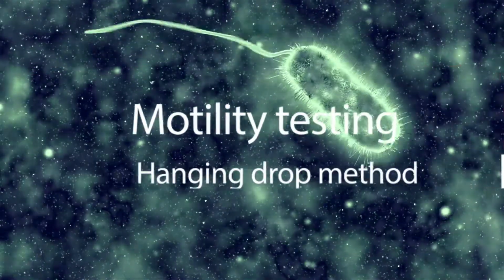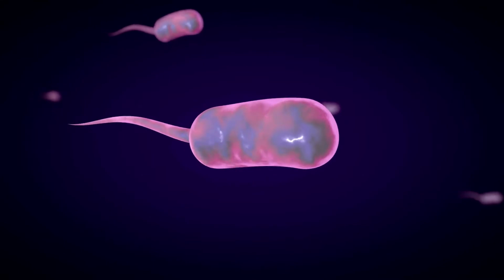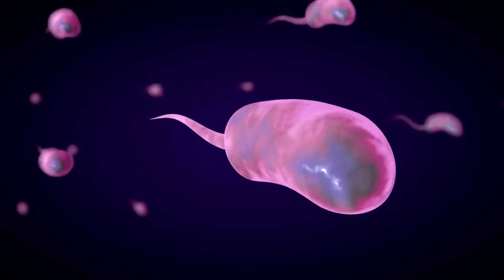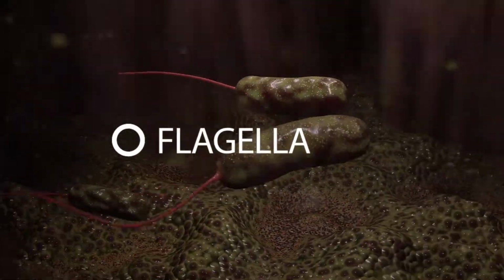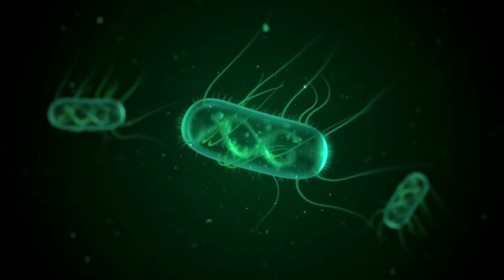Motility testing, hanging drop method. The motility in bacteria is largely credited to the presence of large hair-like appendages over the body called flagella. These are the locomotor organs of bacteria.